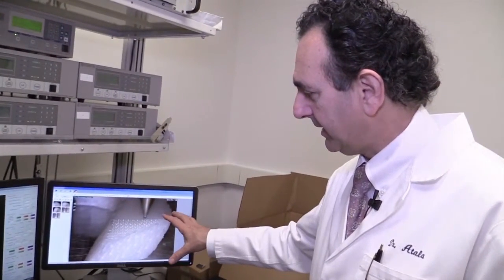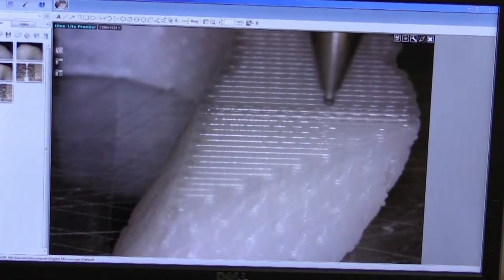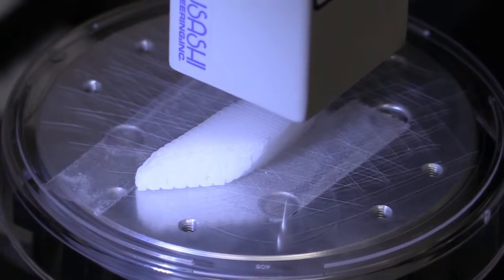This is actually a screen showing you what's actually happening at the printing level, so you can see the actual printing process going on on the scaffold itself, and this is actually a piece of a jaw bone.